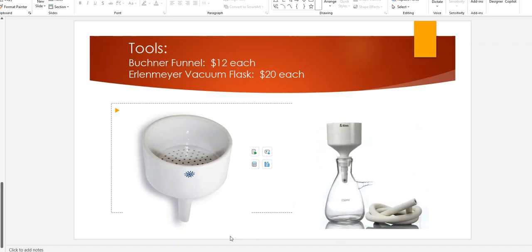Sometimes we've got a little better situation at our disposal, depending on what we have on hand and what our budget has, so we can get things that are disposable, one-time use, that we can filter samples through and throw away, so that we don't cross-contaminate. So we'll see the day that you come into the lab, and yet again, I will show you either way that we use those. I will show you and demonstrate one of the samples before you get started on that day.